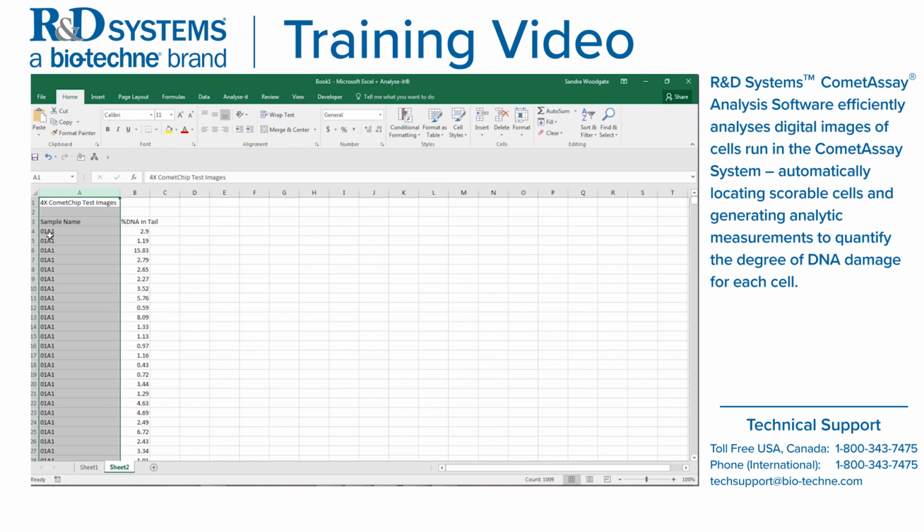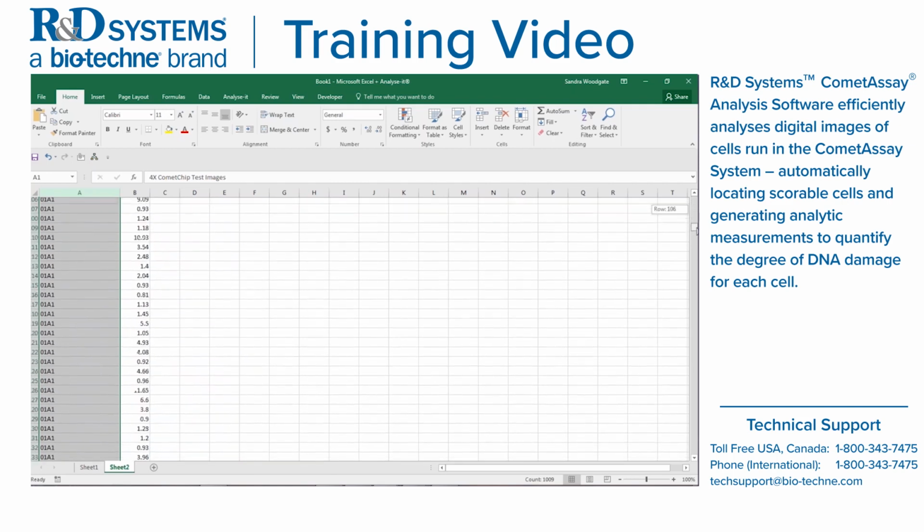And remember, we had like 171 comets. So these were originally comets, say 1 through 171, but they're all being called off that same well number. But you still have the associated damage parameter. So you now have all the data listed. So you can also see here I've got slide 1, well 2.